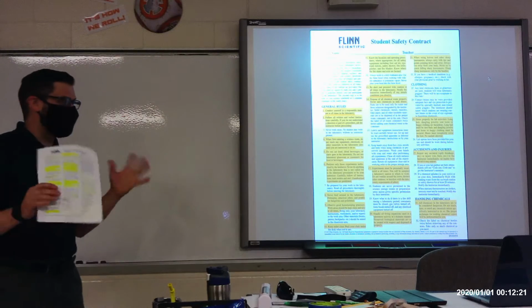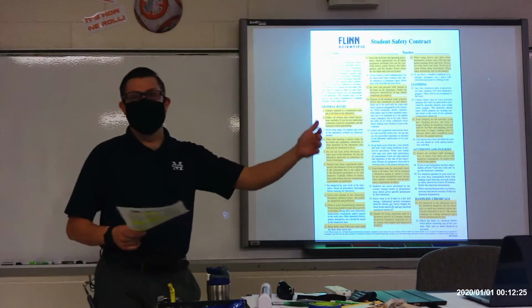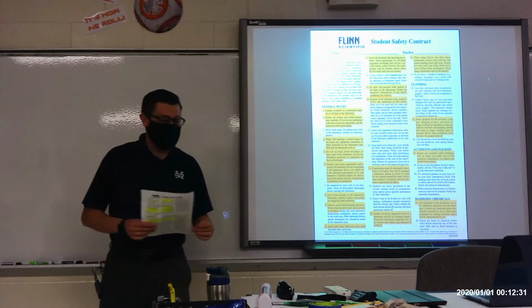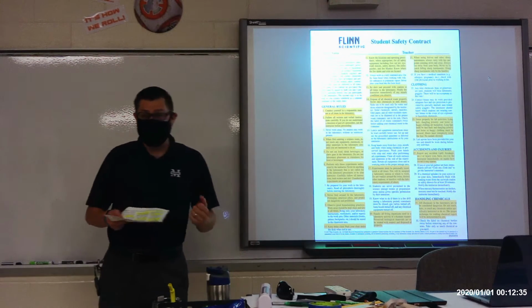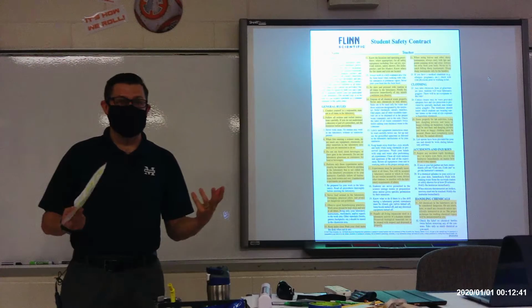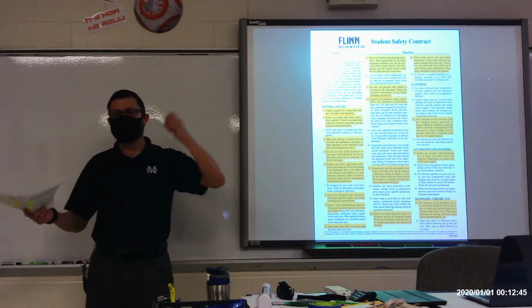So you never want to do anything that you haven't been explicitly told, hey, you need to do this, because you never know what could happen. If you go next door into a chemistry lab and you mix two chemicals and you're not quite sure what's going to happen, it could explode, literally. Mix two chemicals together, you might create toxic gas that could kill you. So you never want to just throw together anything.